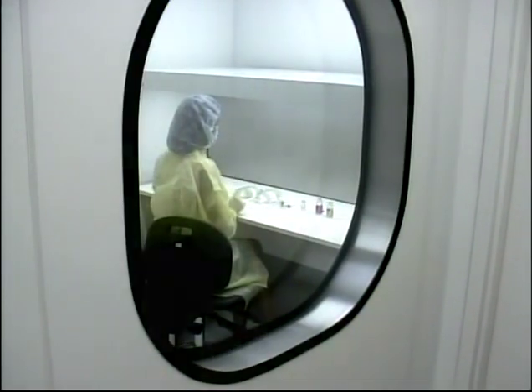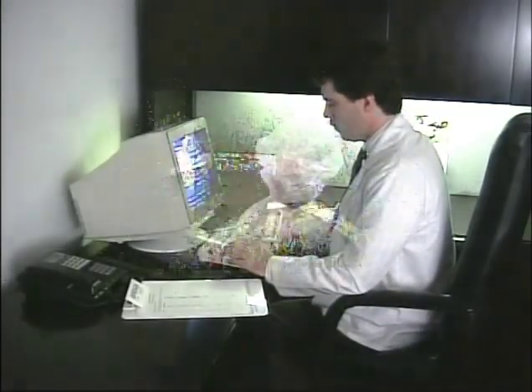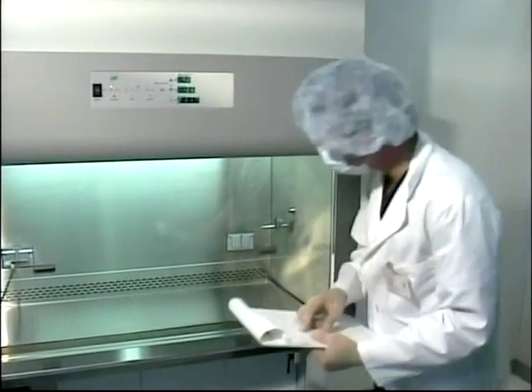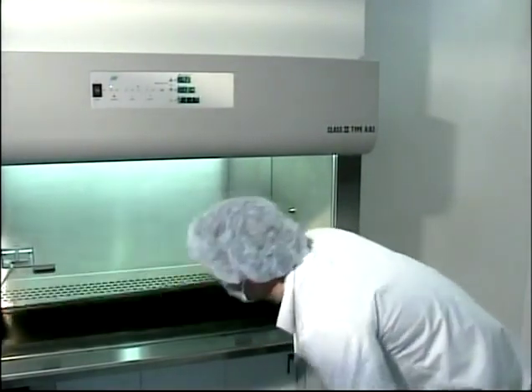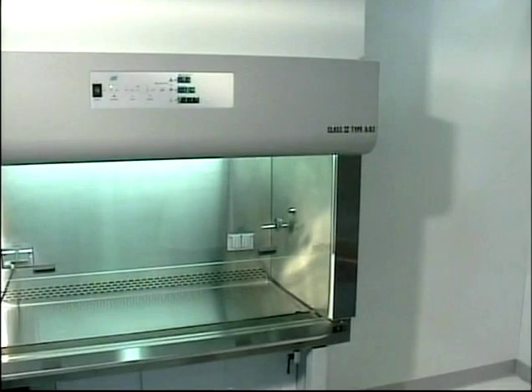Continuous ongoing monitoring will be conducted by your pharmacy preceptor or supervisor and will include regular observation of your performance. Along with observation, the supervisor will verify that the necessary documentation, including the refrigerator and freezer temperature logs, the hood cleaning logs, and equipment and compounder calibration records, has been properly completed.